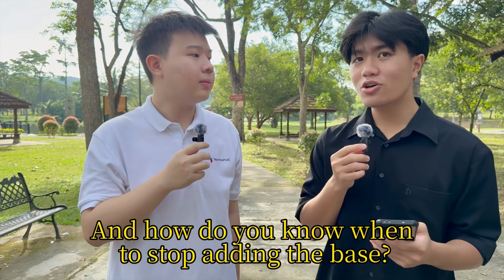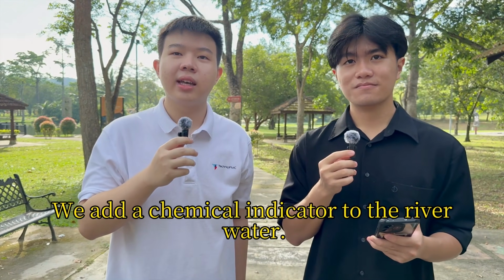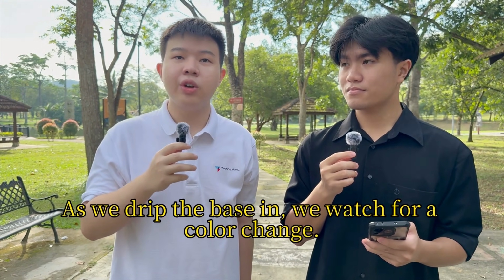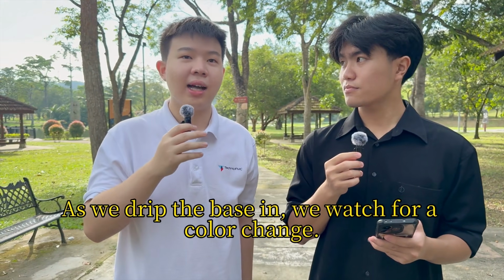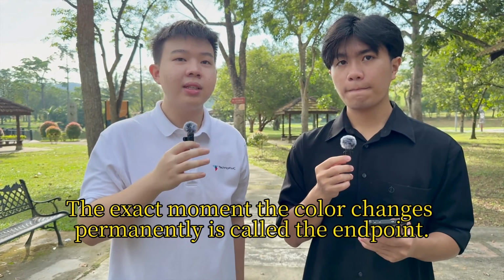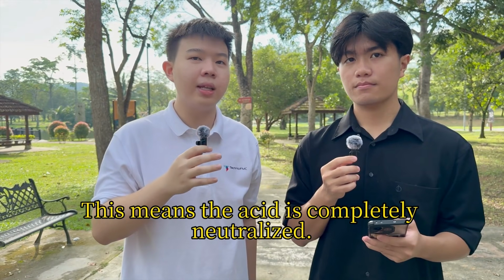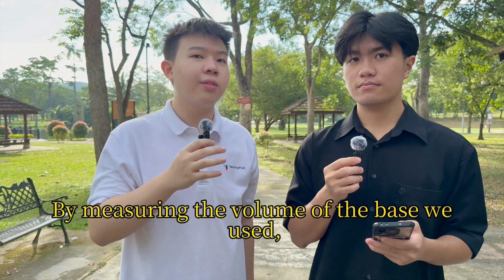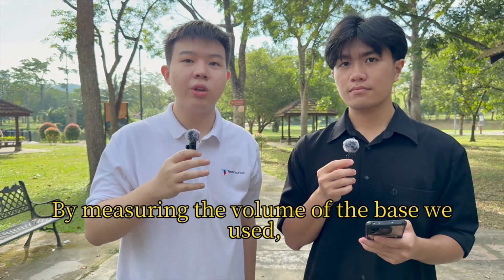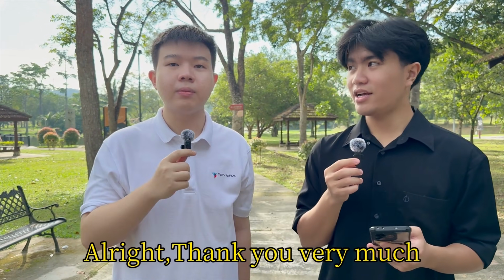Okay. How do you know when to stop adding the base? We add a chemical indicator to the river water. As we drip the base in, we watch for a color change. The exact moment the color changes permanently is called the endpoint. This means the acid is completely neutralized. By measuring the volume of the base we use, we can calculate the exact concentration of the pollution. Alright, thank you very much.